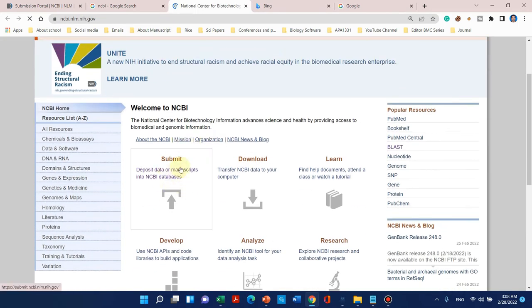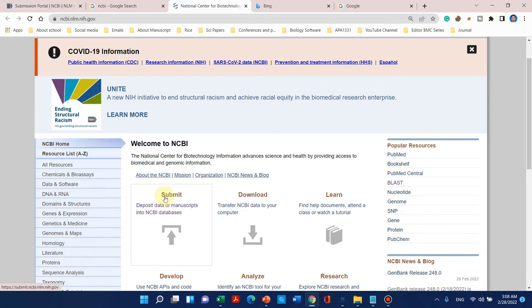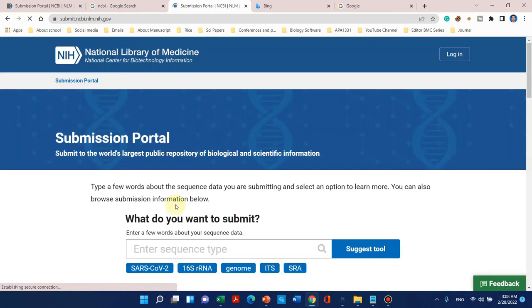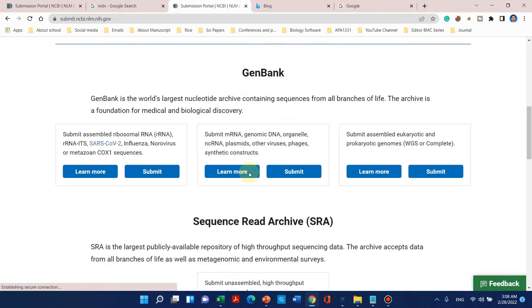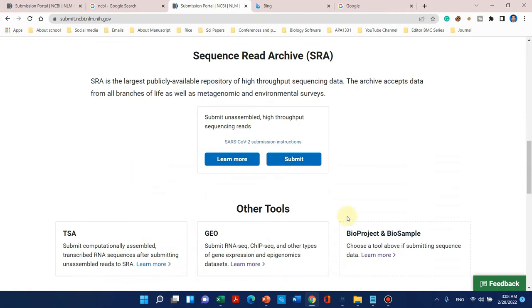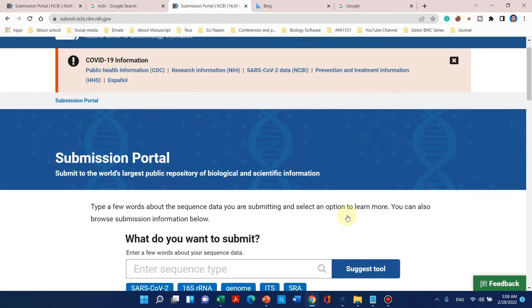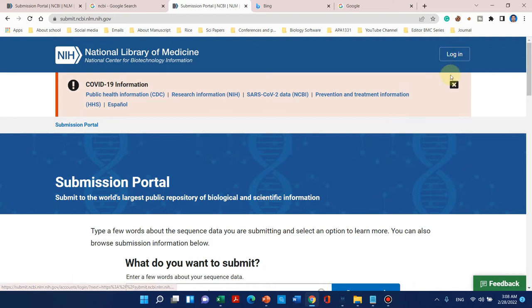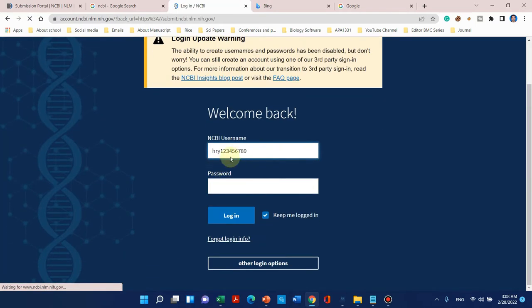In the middle of the NCBI website we can see there is a submit option. We can click on this submit option because it says 'deposit data and manuscript into NCBI database.' This is the platform where we can submit our data. Before that, let me log in — we can simply log in using this tab.